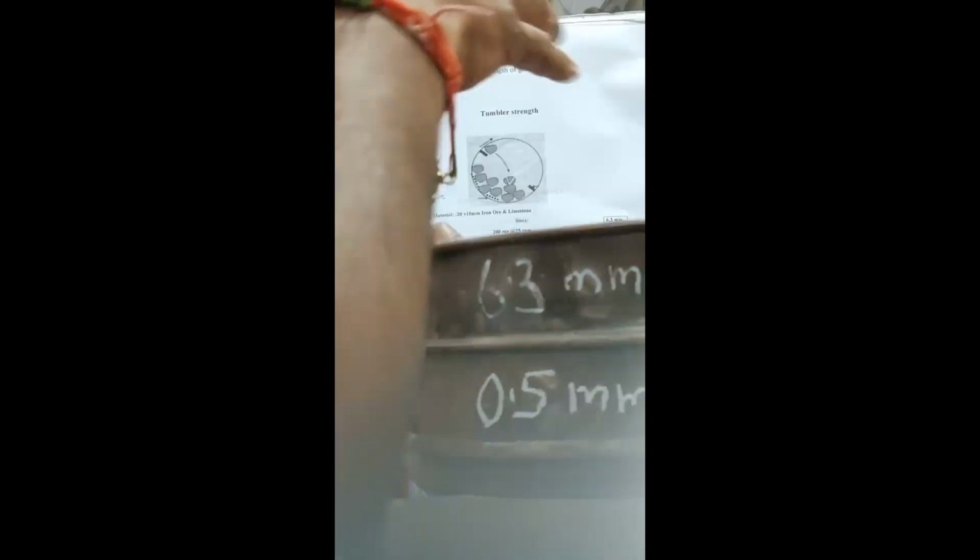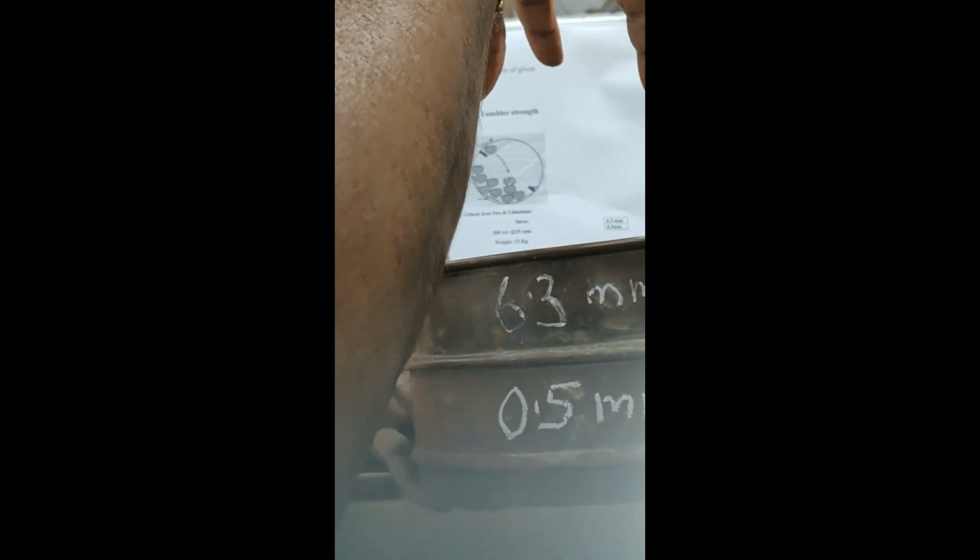Once the material is taken from the tumbler equipment, we put it on the 6.3 mm screen. We have to consider 2 fractions: the material retained on the 6.3 mm, that is plus 6.3, and the material passed through the 0.5 mm screen, that is minus 0.5. So we take the weight fraction of the plus 6.3 and the weight fraction of the minus 0.5 mm.